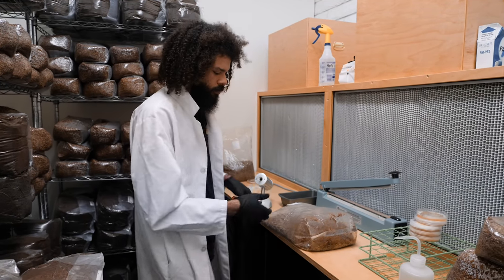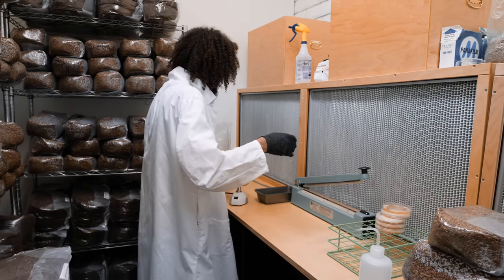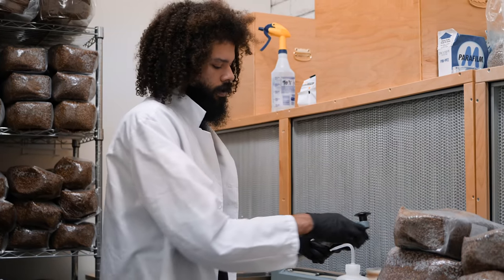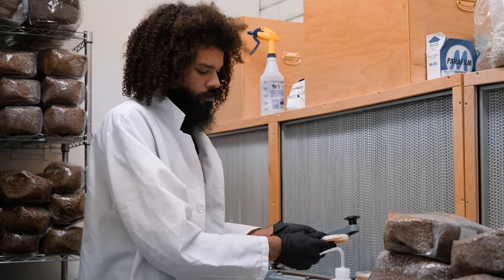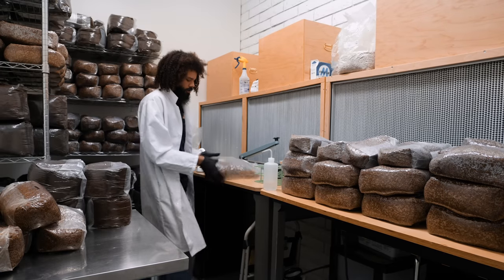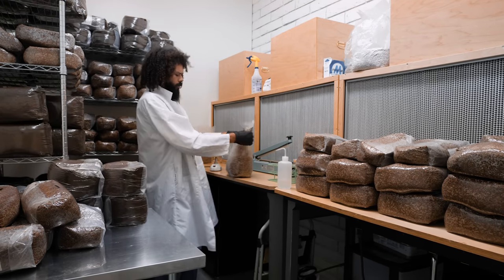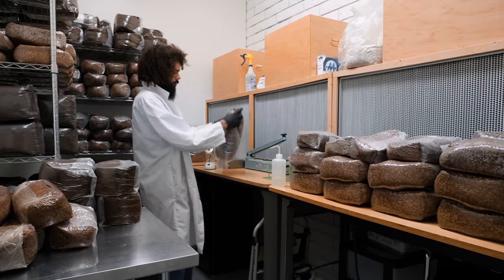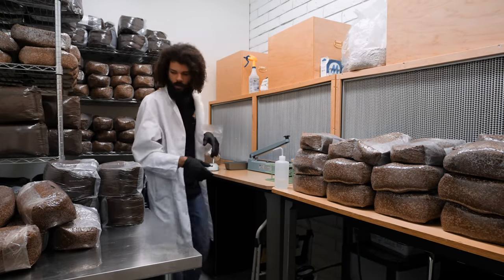I'm working with three different strains of cordyceps today to see which performs best in my environment and with my conditions. Cordyceps requires a unique diet — the grain is hydrated and then supplements are added, like nutritional yeast and similar things, to really help boost the mycelium and the actual production of necessary medicinal compounds within the cordyceps.